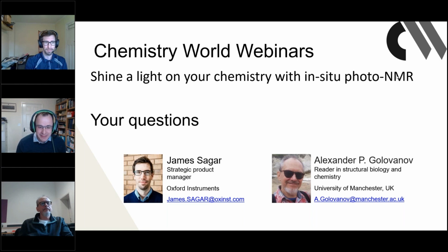And probably Sasha again, maybe James coming in for this one. We've got lots of people, Peter and several others, asking for more information about the NMR torch tubes, things like what the wall thickness is, what they're made out of, and again, lots of people asking where they can get them from, both the tubes and the transparent caps that you mentioned, and are they available in different sizes as well? So maybe, Sasha, do you want to go first on that?